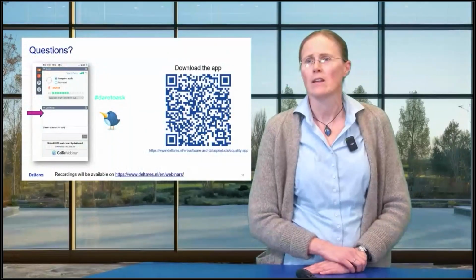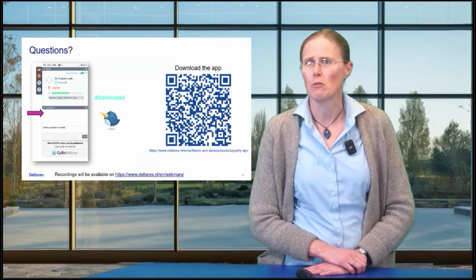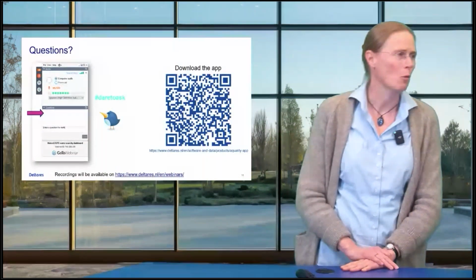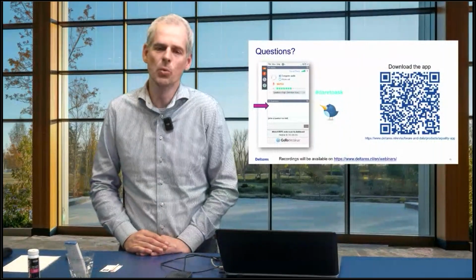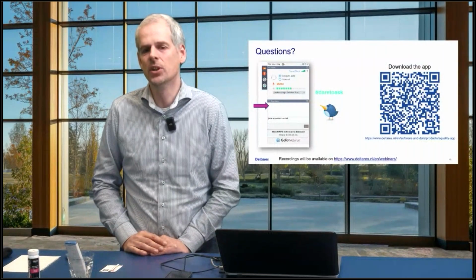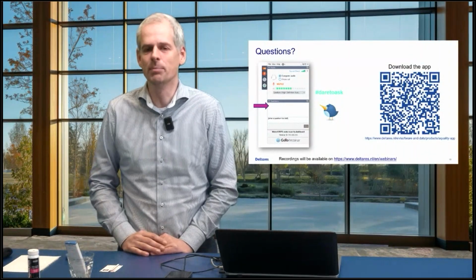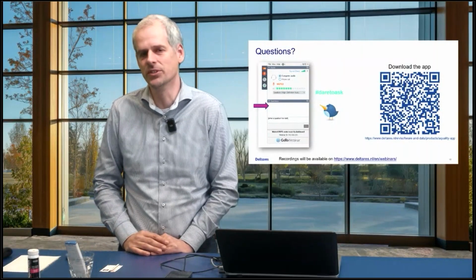Yeah. And then there's another question that says, I've tried the nitrates once and it was really helpful for screening tests. I don't remember if there's a detection limit, high or low, for all of the parameters. Is there a certain range within it for operating it? Yeah, for nitrate, everything below 1 milligram per liter, you don't really see much color change on the test strips. So it's good to check, of course, before you implement it somewhere, that you have concentration values above that, because otherwise your stakeholders or participants are always getting zeros, and that's of course not so interesting.